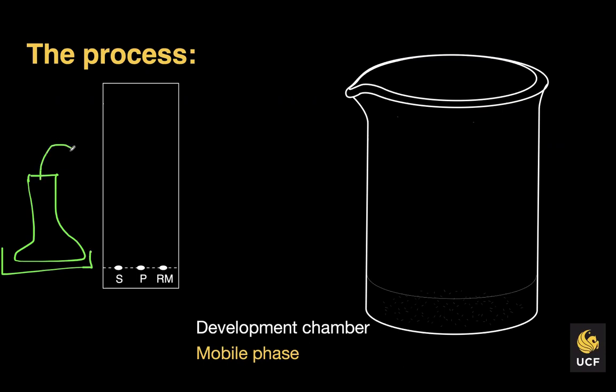So we took a few drops, I think 10 drops of the reaction mixture, diluted it in a solvent, and spotted it on the TLC plate. But to know whether that reaction mixture has been converted into product, we also had 2 standards, one of the starting material, which we spotted as well, and one with the product, which we spotted as well, right?